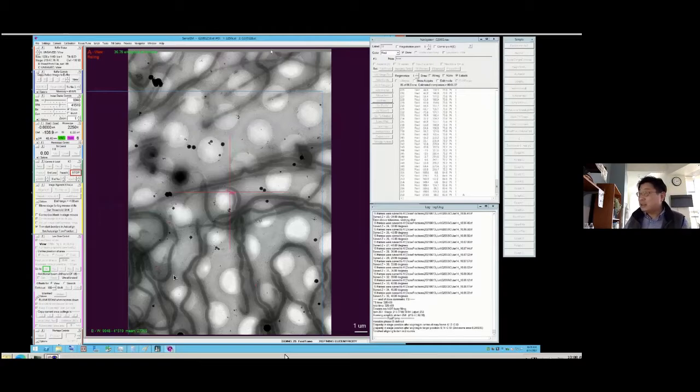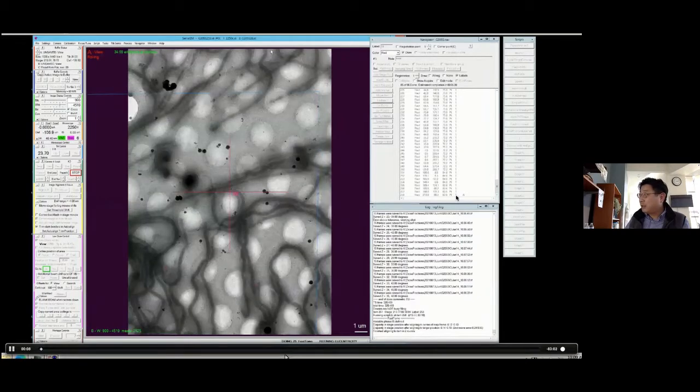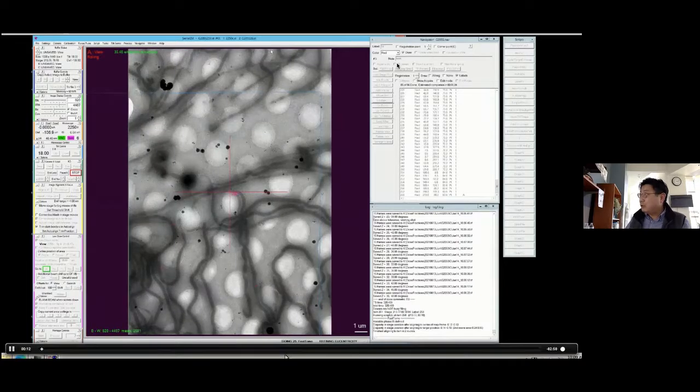So again, I can start to play. You can see this is about 80 minutes. This happened to be the last target. We're going to collect 2 series. The last one is called A. We're going to collect 2 series.